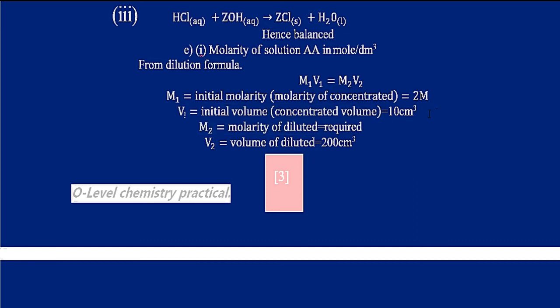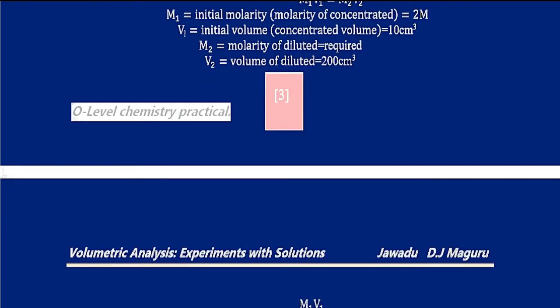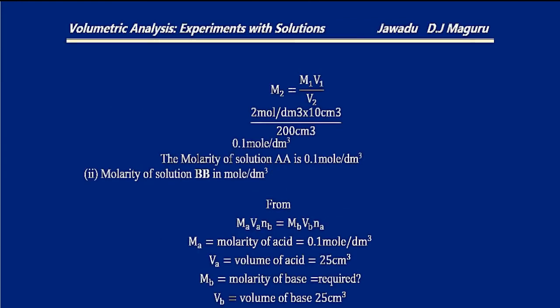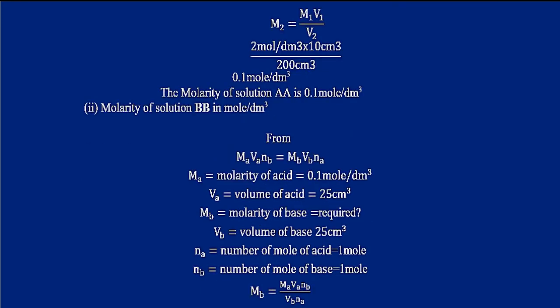Then after the molarity of solution A, we are going to calculate the molarity of solution B, or MB. Because we have the acid, and the hydroxide is the unknown compound, we are supposed to use the molar ratio formula, or MAVA, in order to get MB. I think you see that is our data there.